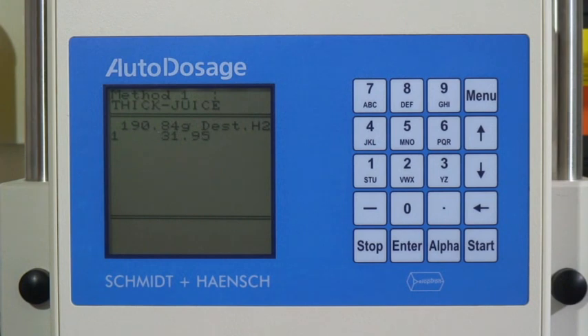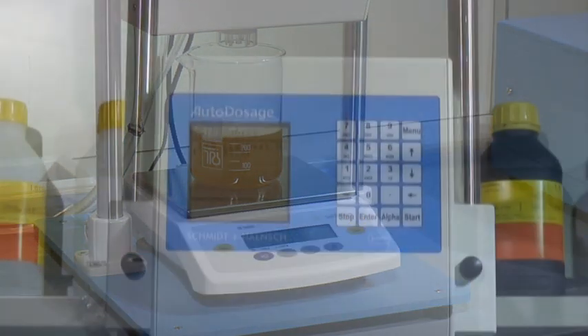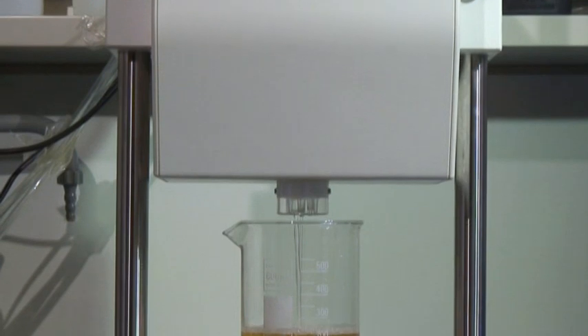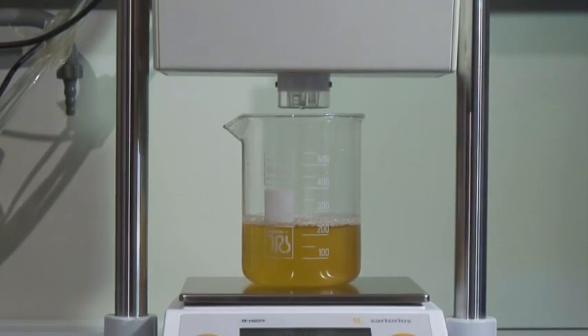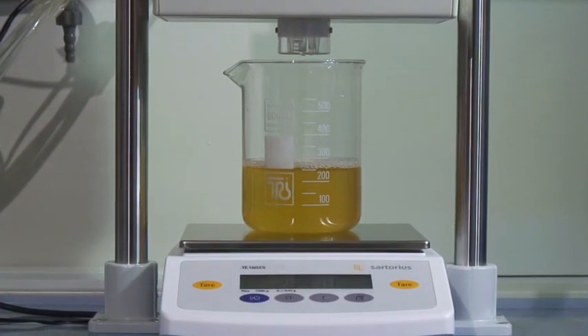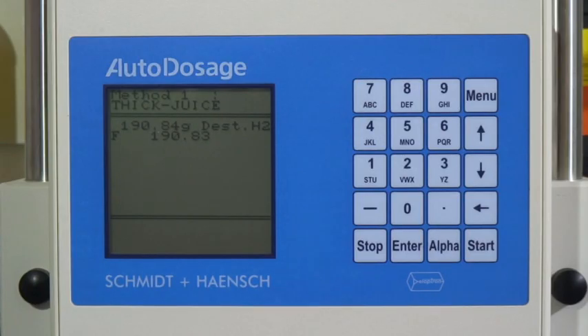The precision of the system depends on the balance used. We recommend a balance with a precision of 0.01 grams; the variation of the results will be plus or minus 0.01 grams respectively. The system is a learning system, meaning it stores the flow-through speed of the three different valve apertures and optimizes itself permanently. Possible differences to the preset ratio are indicated on the display. Schmitt & Hensch has developed a simple system for dosing liquids as well as definable additions of liquids to solid samples, resulting in an enormous simplification of laboratory routine and leading to much less handling errors.